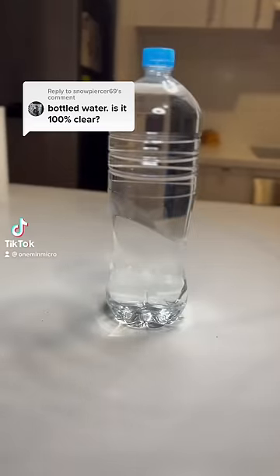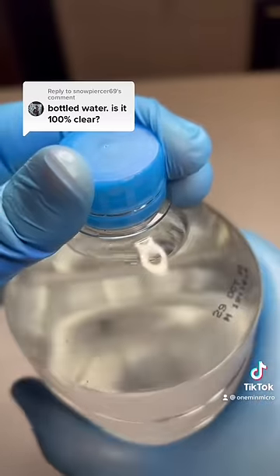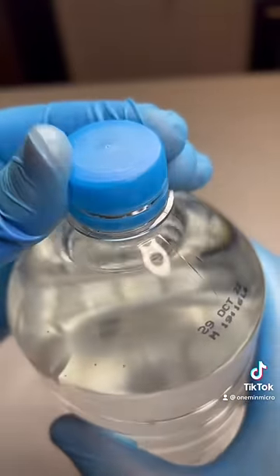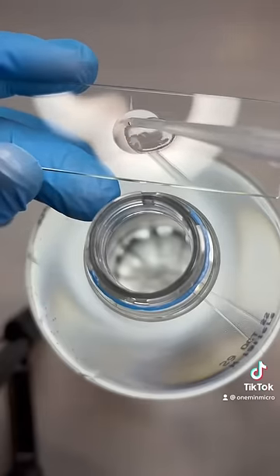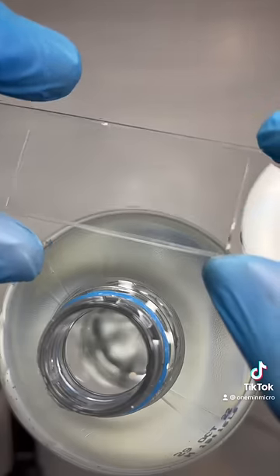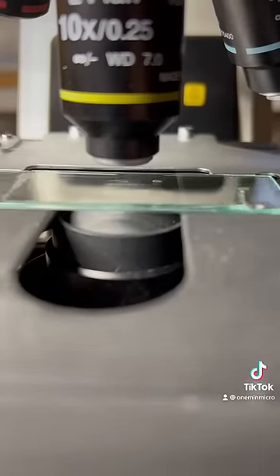Is there anything living in bottled water? I cracked open this water for the first time, and we are going to look at a drop of this water under the microscope. I wonder if we will find any life. You might be surprised by the results.